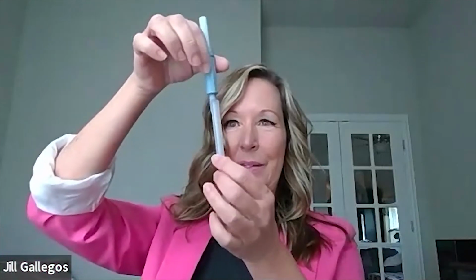So what I've done is I've got a stainless steel surface that is dirty, so that I can demo what a failing result will look like for you. So you just pull this out. Then you're supposed to do kind of a 4 by 4 inch square, like that. Oh, almost dropped it. Let me put that back in.